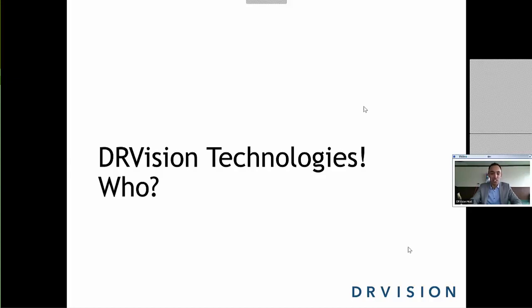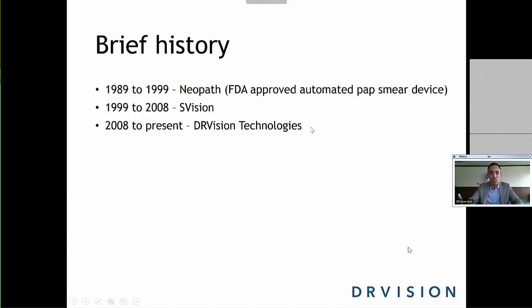But before we go there, I wanted to tell you a little bit about DRVision Technologies, because I think it's relatively unknown, but there is a lot of good technology here, and I'd like to share with you a little bit about the history. A lot of the people in this company have been together for a long time. They were part of a company called Neopath that created the first and still the only automated pap smear test device.